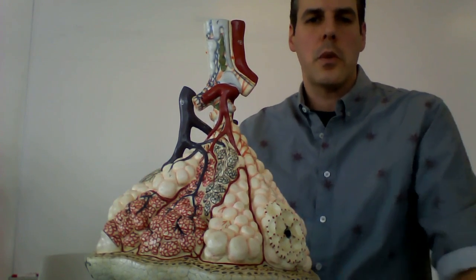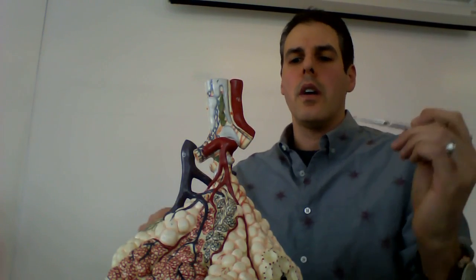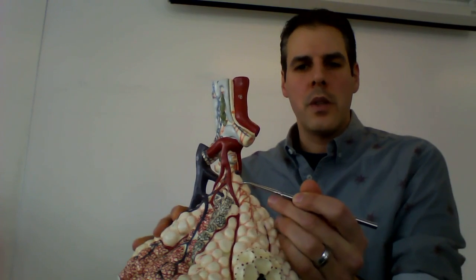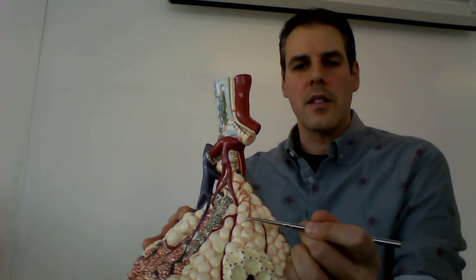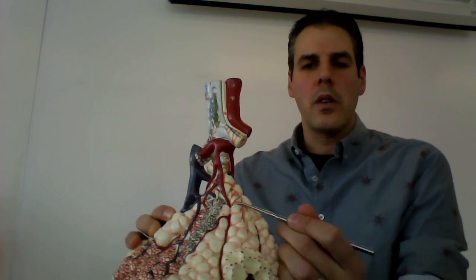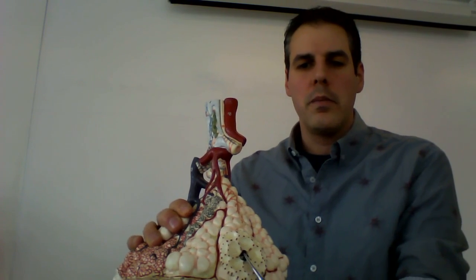To me, respiratory bronchioles are called respiratory bronchioles because they have alveoli on them, the air sacs here. And so this one here, as it's coming down, at least shows that there are a couple of these little air sacs, alveoli, here. Now, as we go down beyond that, we're going to lose this smooth muscle, and down deep in here, say up in here would be a little tube. Okay, that's the alveolar duct. And then from the alveolar duct, we go into this little flower right in here, this little sac. This is the alveolar sac.